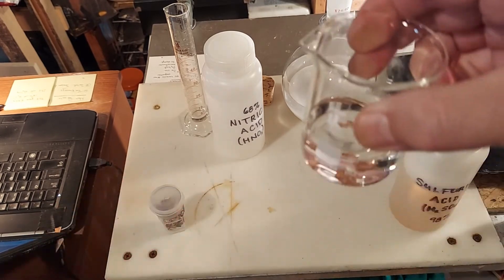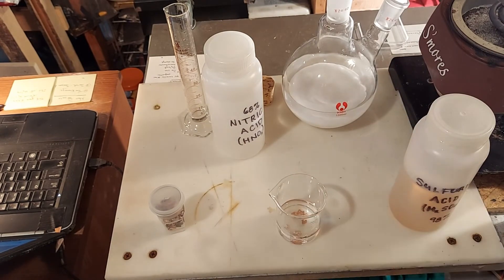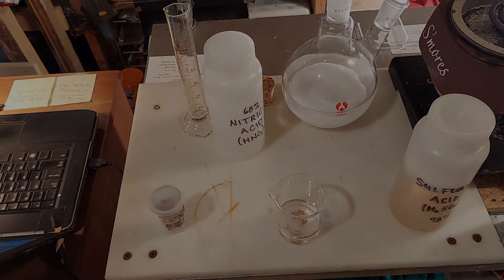We can see we've got little bits of copper inside there, and we're going to wait for those acids to go to work and see what happens in a few weeks.